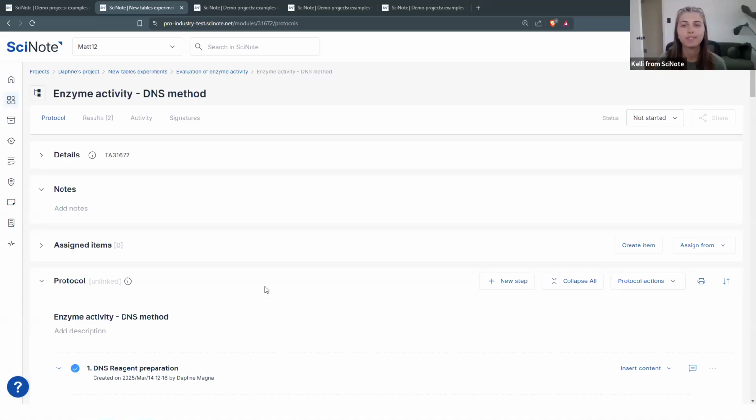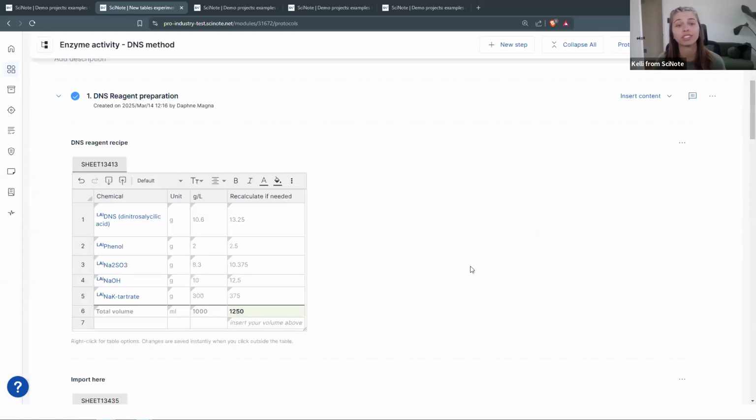Right. So another question, kind of similar to Excel, but can you freeze a top row or the first column in a table? I can answer this one. Yeah. So currently this is not supported yet, but we will note this down as feedback and we can look into whether this is something we could support in the tables.